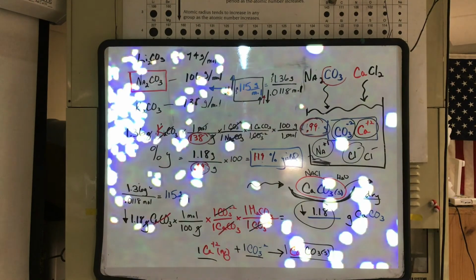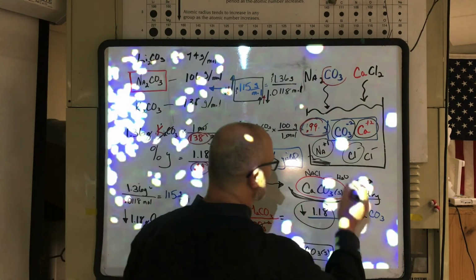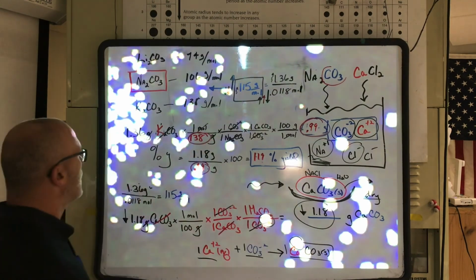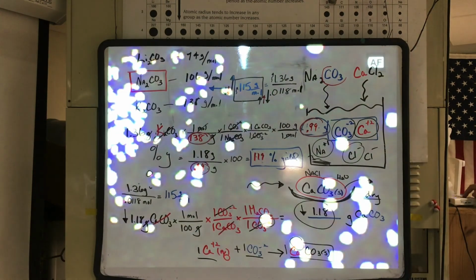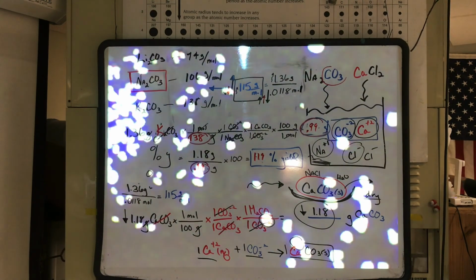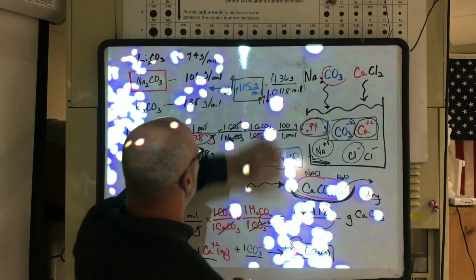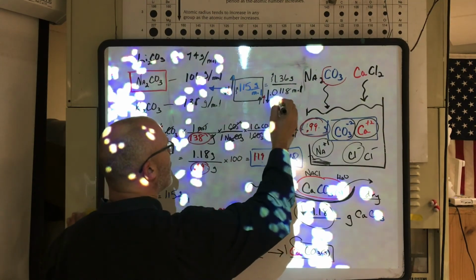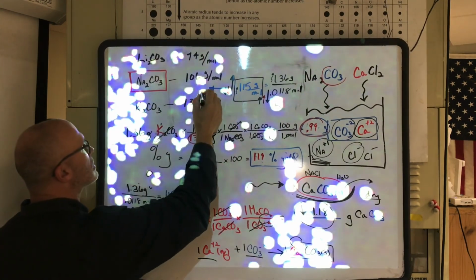So what's really neat is looking at the microscopic world, so to speak, although we're not really. This is sample B over here. Look at the size of these individual pieces of crystal. And look at the size of these. These are much smaller pieces. Getting the best view I can, it should be clear to you that B, to the right here, these crystals are physically bigger than the crystals here. So these are the potassium carbonate, and these small little crystals are the sodium.